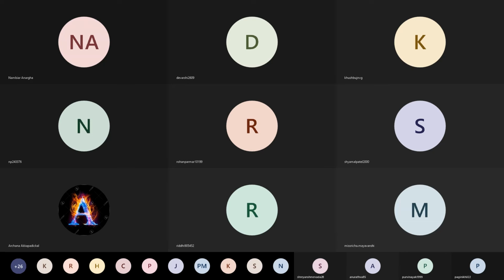So the RF value, why are we getting the RF value very high or very low? What is the reason behind that? What is the interaction between the analyte molecules and both the stationary and mobile phase molecules?